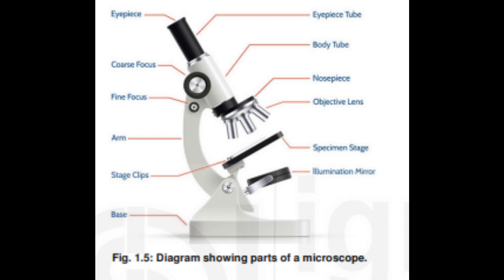Aberration is noted in high magnification objectives, magnifications greater than 25x. Aberration influences the sharpness or quality of the image. The aberrations of a lens increase as the relative aperture of the lens is increased. Eyepiece, ocular lens. Eyepiece is the lens which is used to observe the image. These lenses are usually of 10x or 15x magnification. The eyepiece helps in forming an enlarged virtual image that can be seen by the observer.